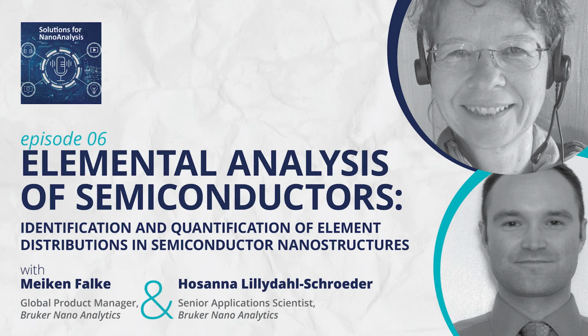Yeah, and as an aside with EELS, don't you also have issues with deconvolution with that technique as well? Yeah, this deconvolution is maybe not as straightforward as with EDS, since, as I mentioned, the background is so complicated, and all processes which have happened at energies below the energy I'm looking at are convoluted with each other and need to be tackled when I want to subtract the real background.